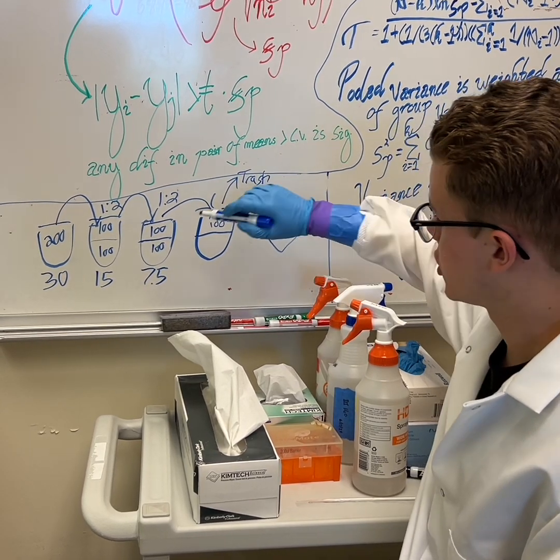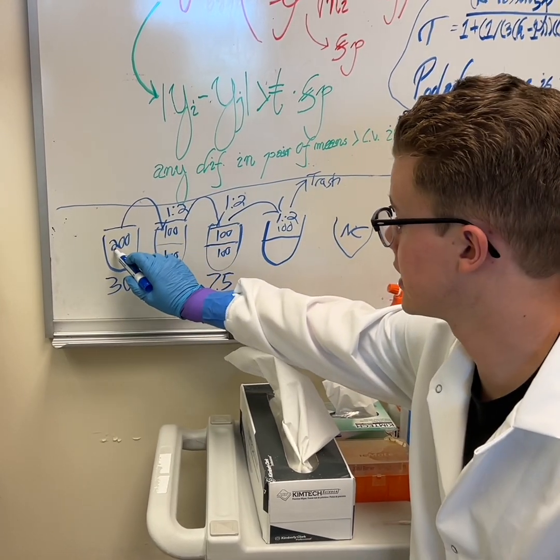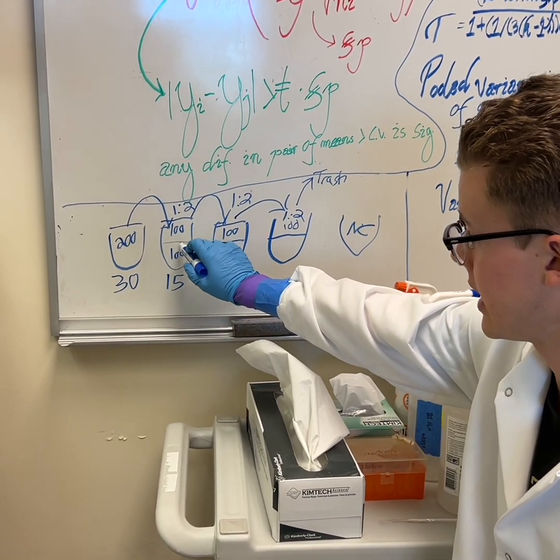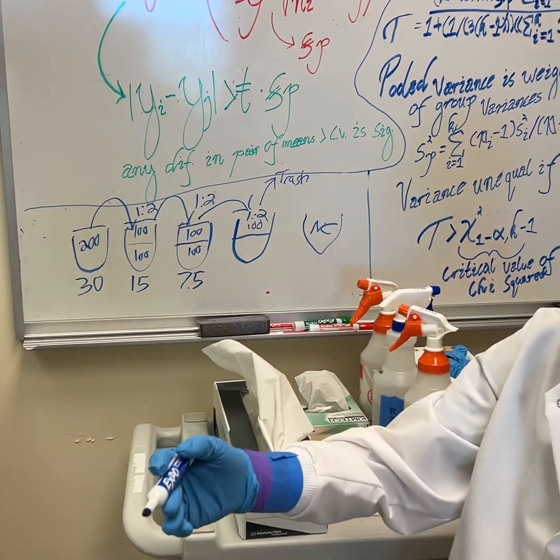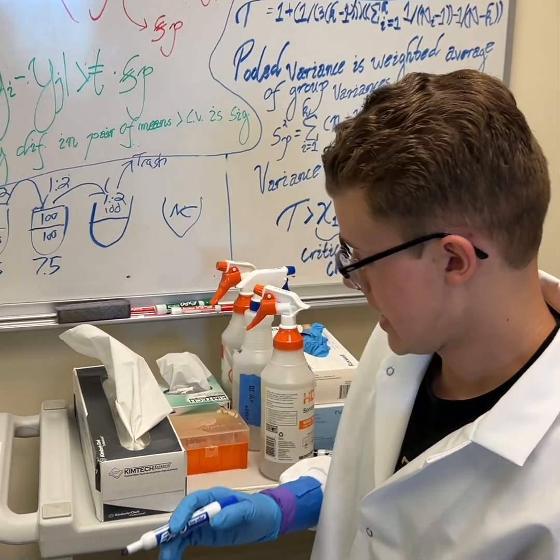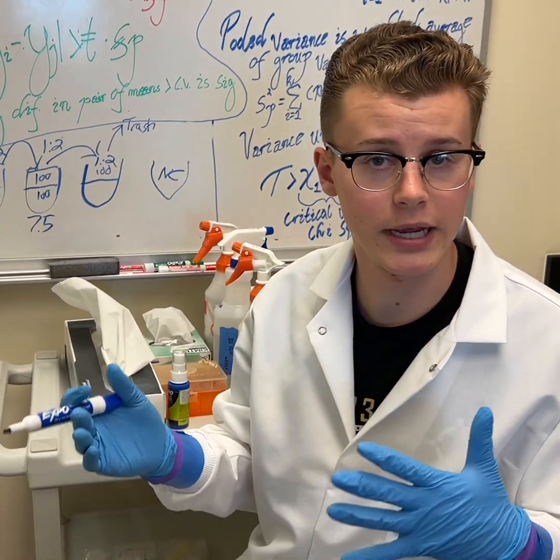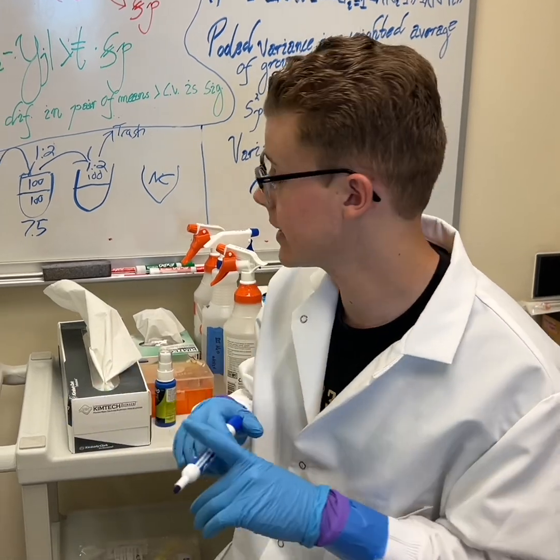Okay? So that every single well after this is just going to have 100 microliters, right? Because this had 200, we took 100 out, and then this had 200, we took 100 out. So everything's going to have 100 microliters except for the negative control, which will be left empty. Now, then you can incubate it for 24 hours or more based on whatever you're testing.